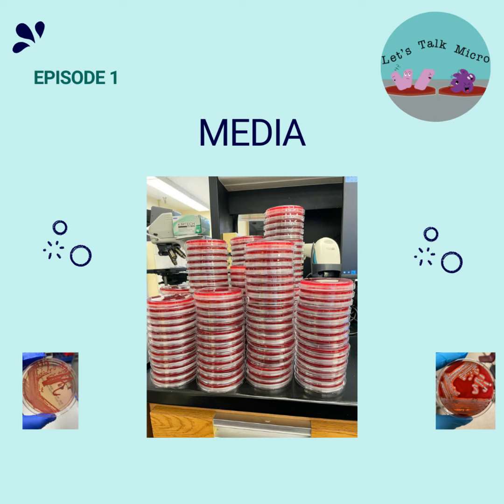And that brings us to the quiz time. So let's start with blood agar. What kind of media is blood agar? It is nutritive and it is differential for hemolysis. It is not selective. Gram-positive cocci, gram-positive rods, gram-negative rods, gram-negative coccobacilli, yeast, they will grow on this agar. So it is not selective, but it is differential for hemolysis, right?